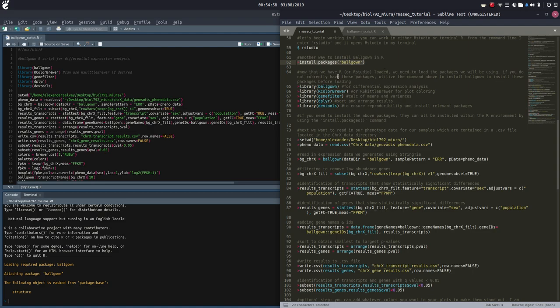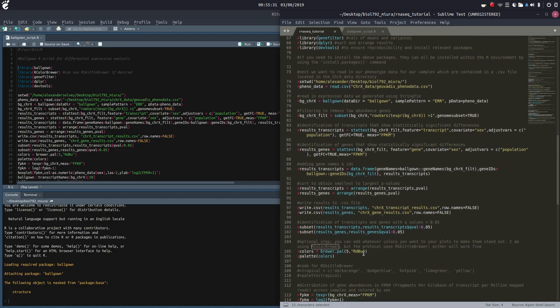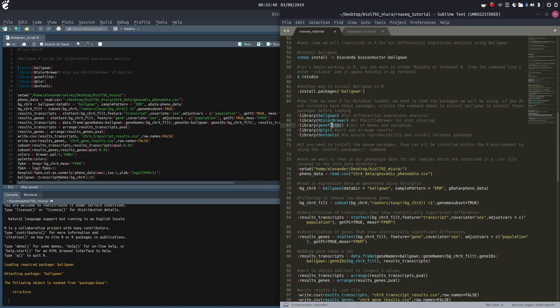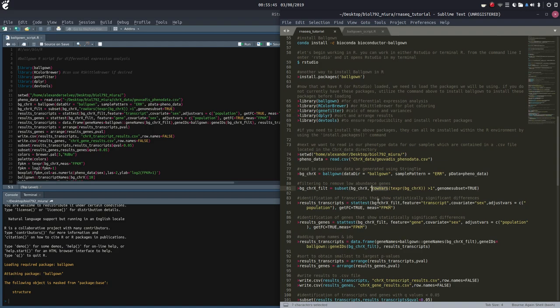Now that we have RStudio loaded, we need to load the packages we're going to be using. If you do not currently have these packages, you can utilize the install.packages command to install ballgown and the other packages. We're using RColorBrewer — I couldn't get RSkittleBrewer to install, which the protocol uses, so I decided to use RColorBrewer instead and I've included my code just in case. I've also included the RSkittleBrewer code if you'd like to use that. We're going to be using genefilter — rowVars is a genefilter command for calculation of means and variances. We'll use dplyr to sort and arrange our results, and devtools to ensure reproducibility and install relevant packages.